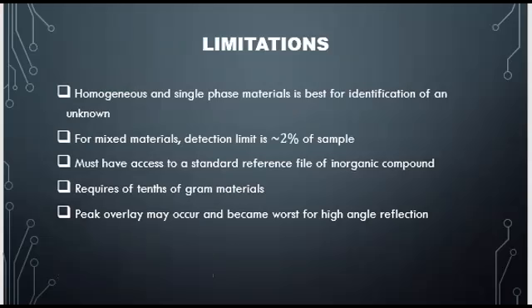And like other machines, there are limitations. To get the best result, a homogeneous sample with a single phase should be analyzed. For composite or mixed materials, the limit of detection is 2%.